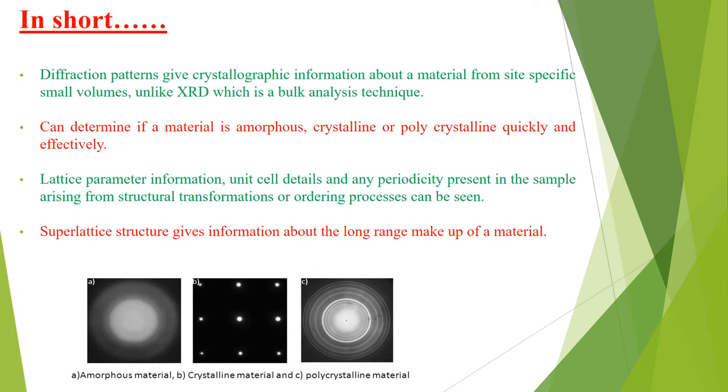In short, we can say that the diffraction pattern gives crystallographic information about a material from a site specific small volume, unlike XRD, which is a bulk analysis technique. We can determine if the material is amorphous, crystalline or polycrystalline quickly and effectively. Lattice parameter information, unit cell detail, and any periodicity present in the sample arising from structural transformation or ordering processes can be seen. Superlattice structure gives information about the long range makeup of a material.